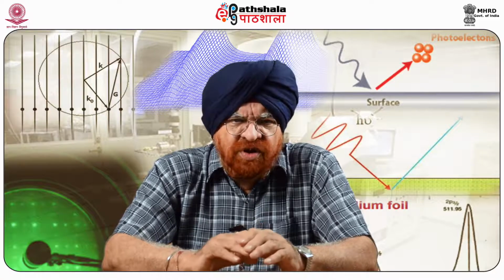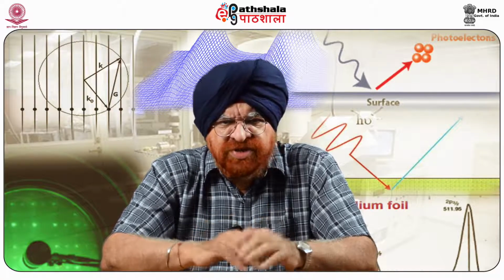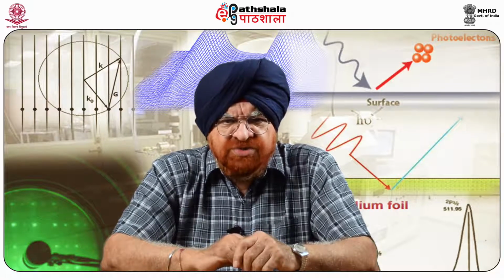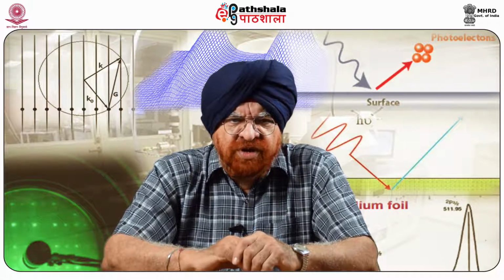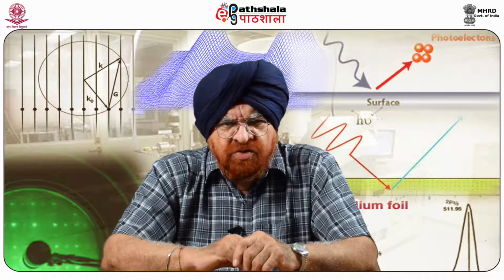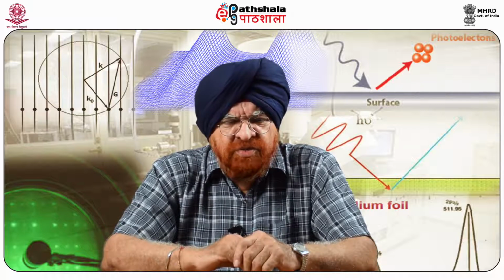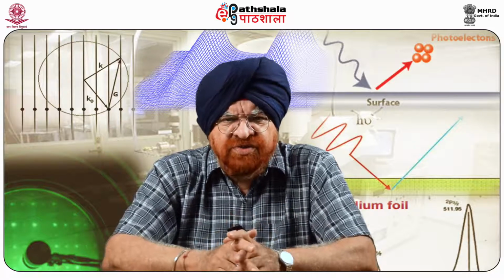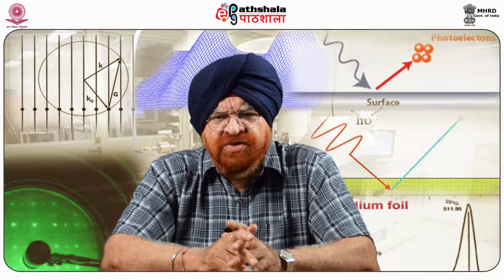It is able to investigate adsorbate layers, or adsorbate dynamics, as we call it. It can also study metal electrodeposition. It is able to carry out an in-depth study into phase transitions at metal electrode surfaces.